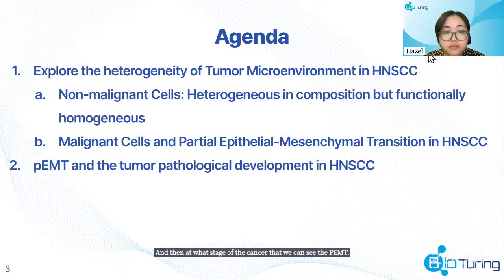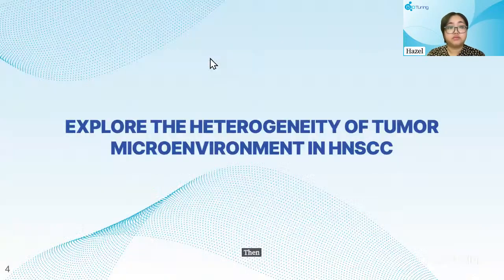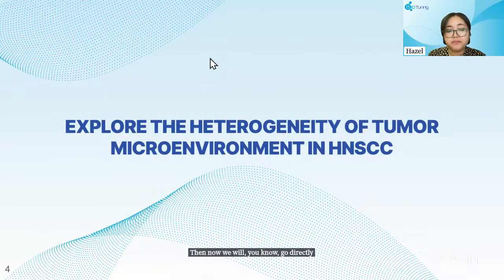Okay, now we will go directly into our first part, to explore the heterogeneity of the tumor microenvironment in head and neck cancer. Here, Julie will show you the example data set that we are going to use today.